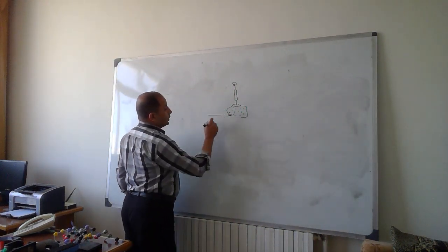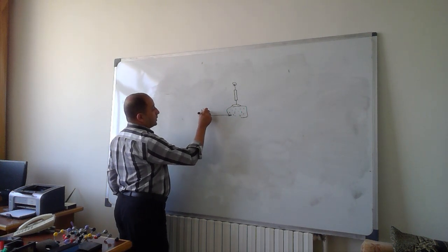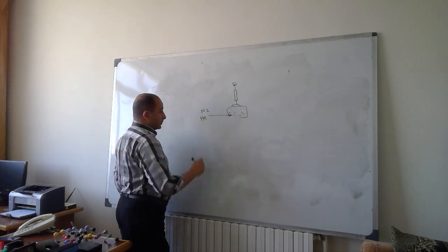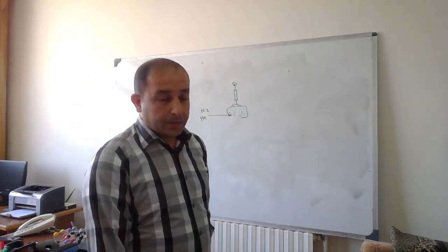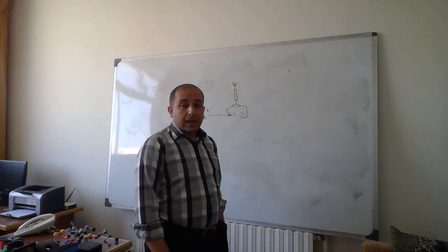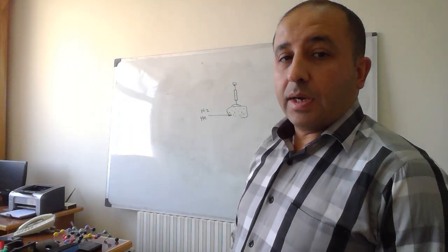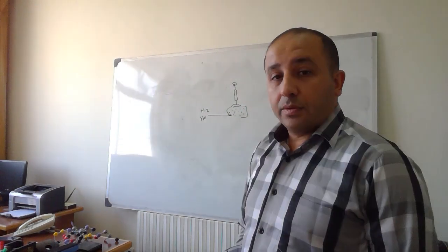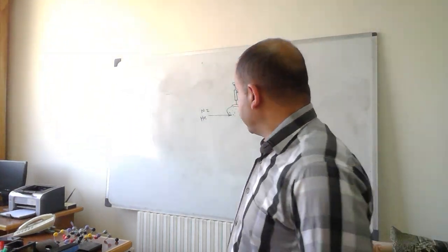Here we will have a jet of inert gas such as nitrogen or helium. Helium is more preferable than nitrogen, but nitrogen is cheaper. Helium is a light gas, whereas nitrogen is a heavy gas. Helium usually has higher purity. That's why it's usually used with gas chromatography mass spectroscopy.